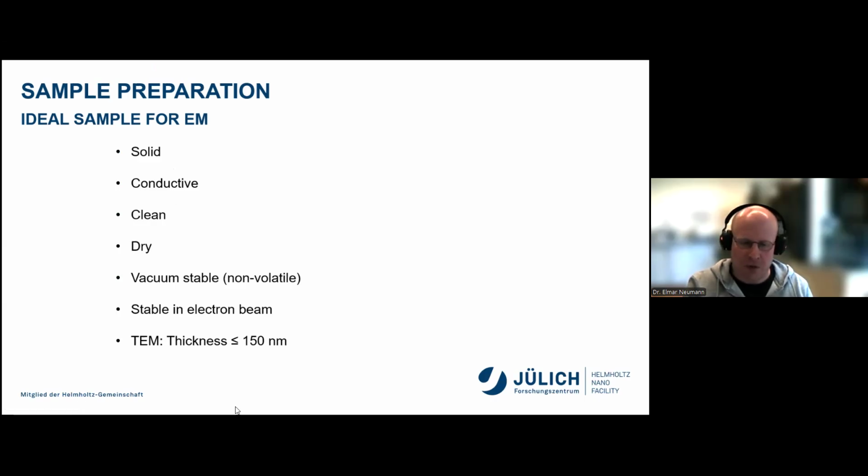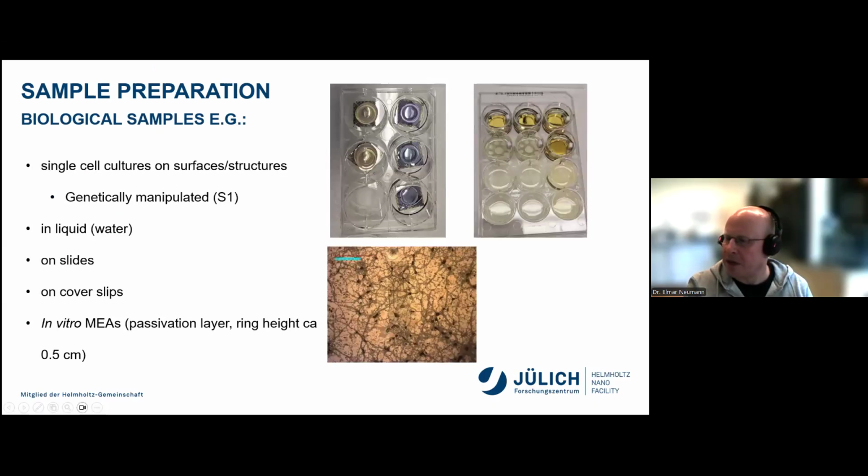But for biological samples, we also have this. None of this applies to what we would like to have in a TEM. We, in most cases, have wet samples, single cell cultures, in many cases on surfaces and on structures, sometimes genetically manipulated with some fluorescent markers. They are in liquid, in most cases aqueous solutions. They are on slides, that means on glass. Nobody likes glass. Or on cover slips, same there.